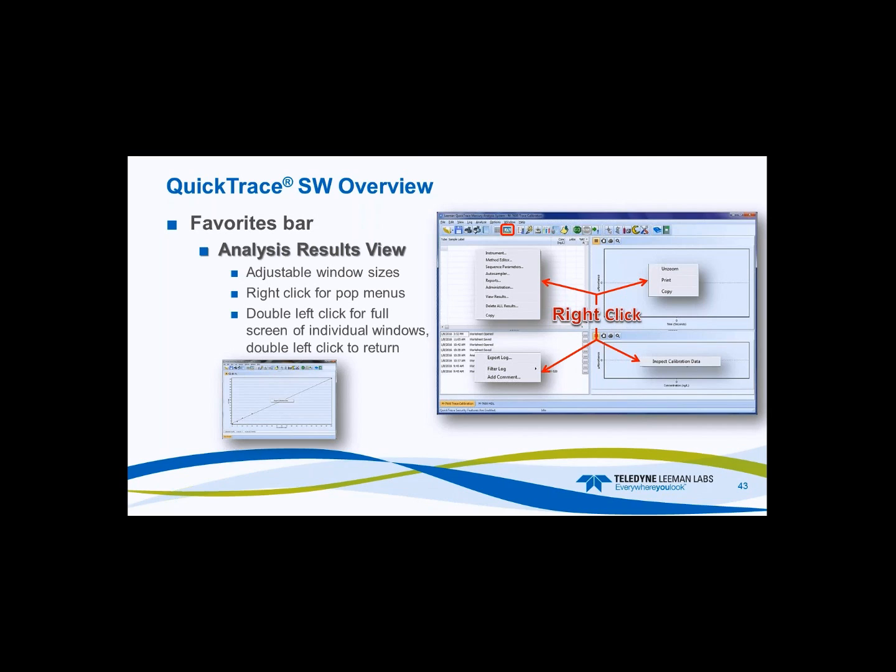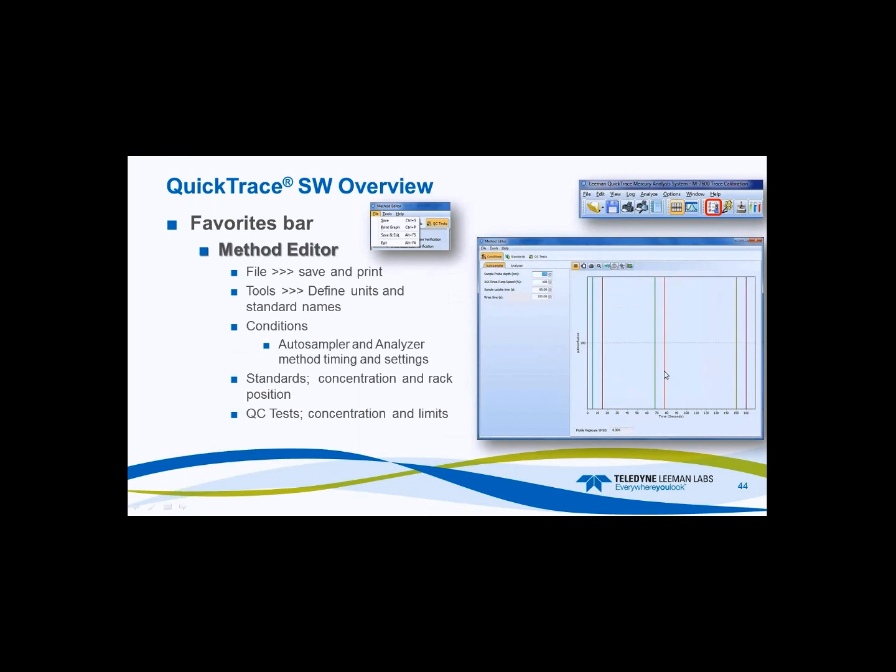Double left click in any one of these sub UIs within the analysis will get you full screen. So then you get full screen of that UI. You then have a better view of a graph. You can inspect your calibration data and so forth. A lot of nice features embedded in this software.